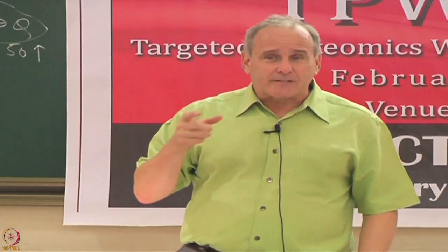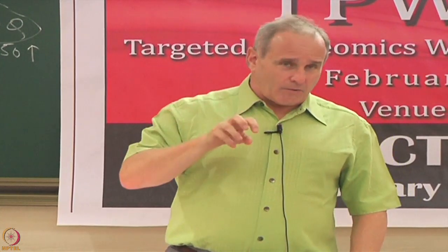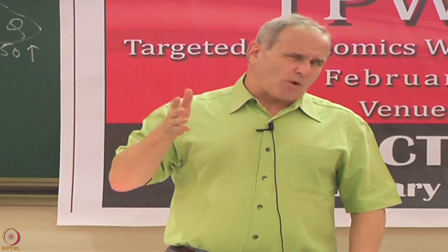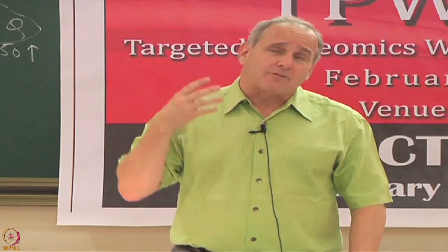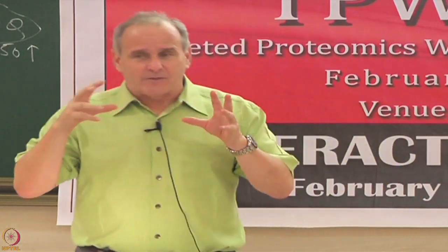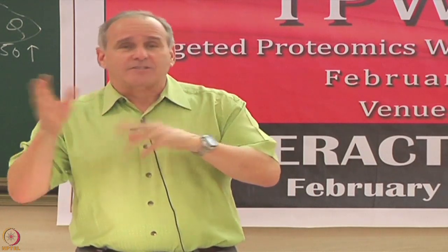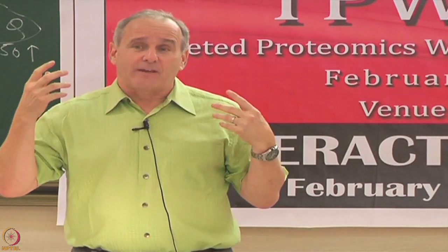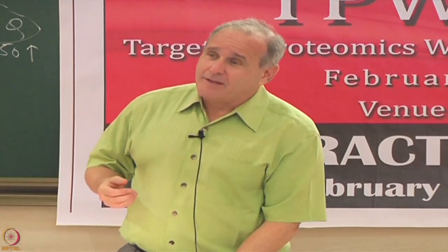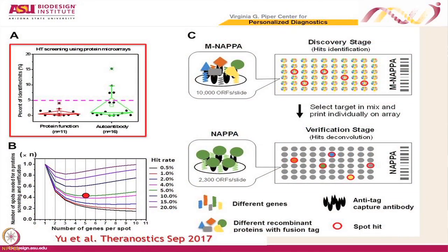So the multiplex idea works when the hit rate is low, and it doesn't work so well when the hit rate's high. And so you can actually mathematically evaluate what's the best or most optimal number of spots to mix based on the likelihood of a hit rate. Okay? And so we actually did that. We developed the equations and we actually looked at it. I'm not going to go through the math.